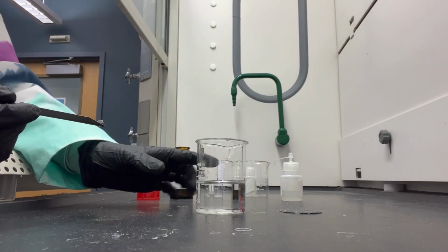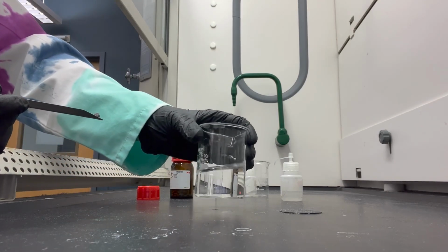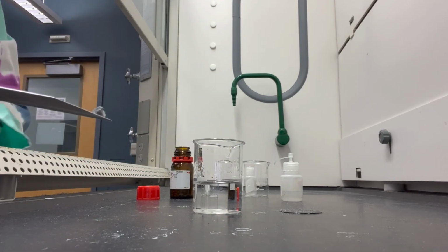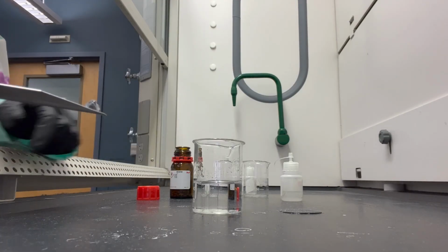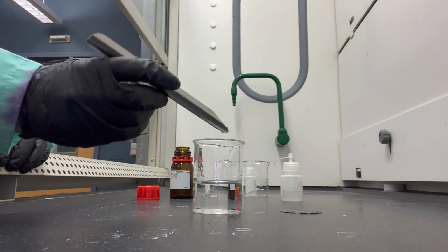Okay, in my beaker I have water and phenolphthalein, and right here I have a piece of solid elemental calcium that I'm going to put into this beaker and have it react.